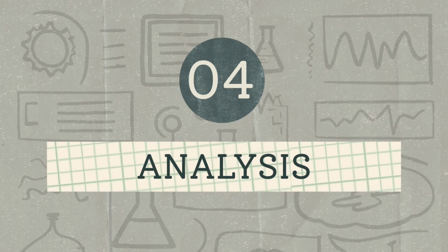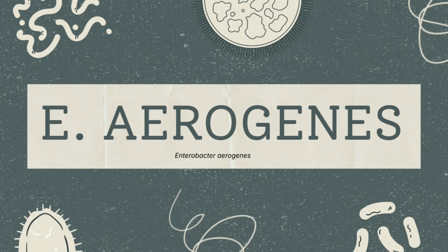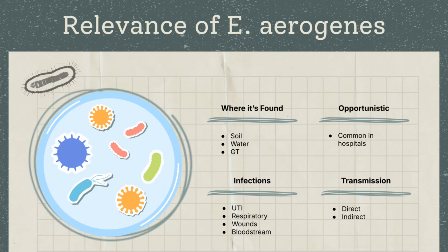And here's my analysis. I have Enterobacter aerogenes. At least that's what everything points to. The relevance of Enterobacter aerogenes. Where it's found. It's found in soil, water, and the gastrointestinal tract. It is very opportunistic, especially since it is very common on us anyways. It's very common in hospitals. I'll get into that a little bit.